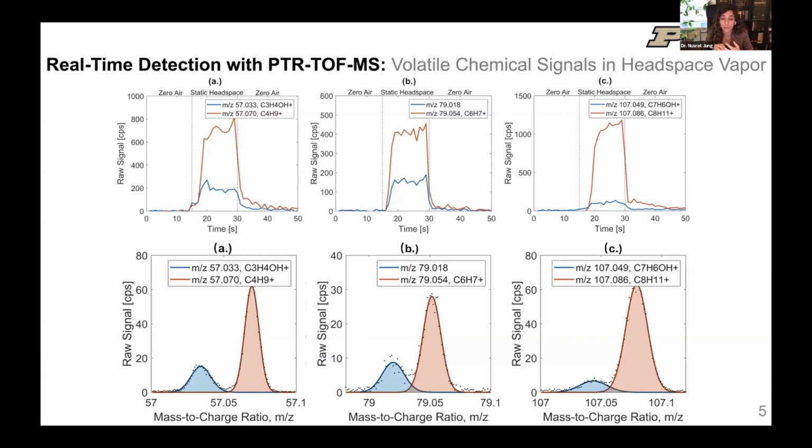This is really important to understand when you're using a handheld photoionization detector. It is providing you with a total VOC concentration, so you don't have the ability to actually speciate what you are looking at. You just get one value, but you honestly don't know the composition of that value. So the separation of peaks, or the understanding of what the emission is composed of, is extremely important for decision making.